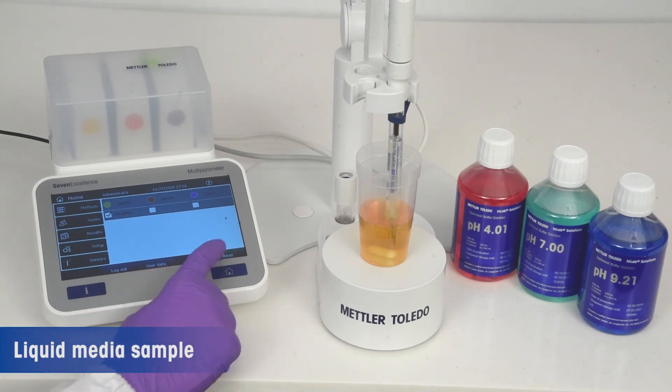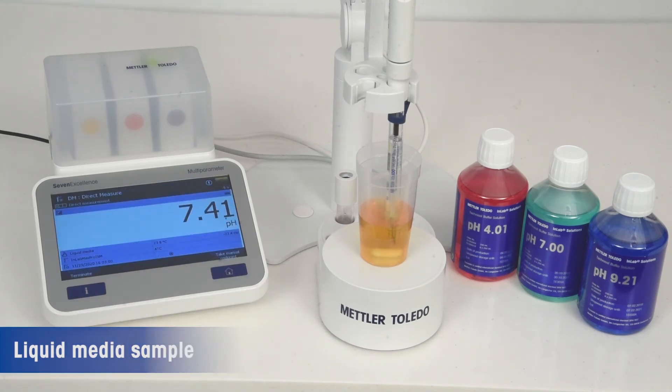For liquid media, take aliquots of the liquid media samples in a clean beaker so as to ensure that the junction is well immersed into the sample.